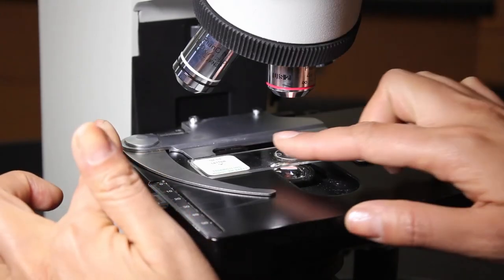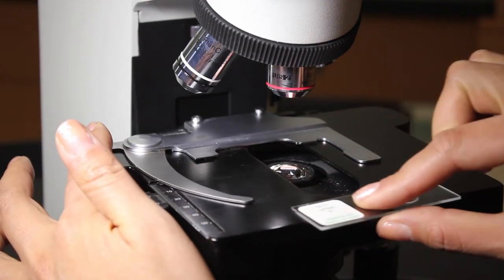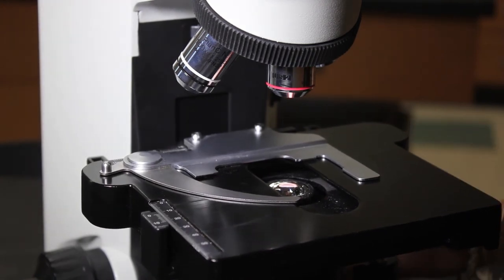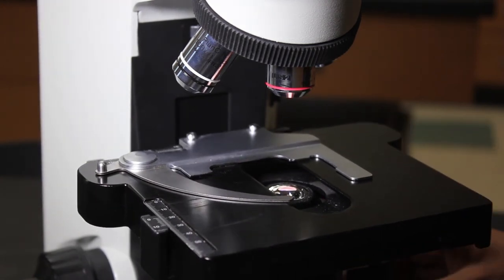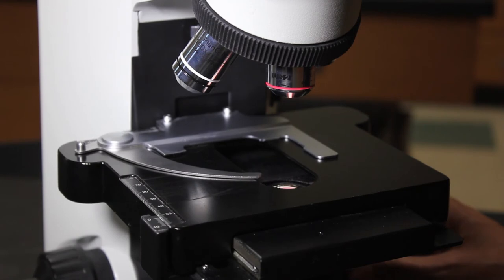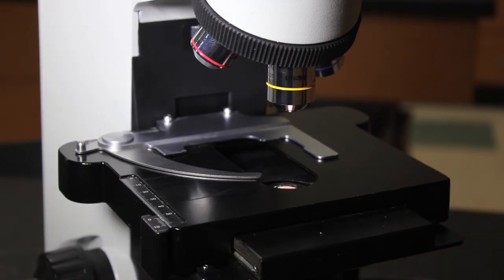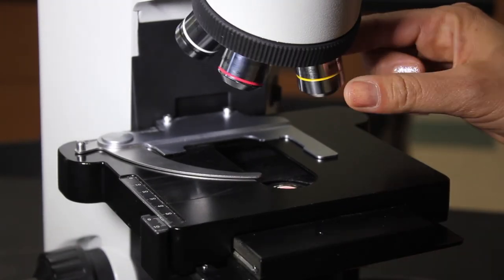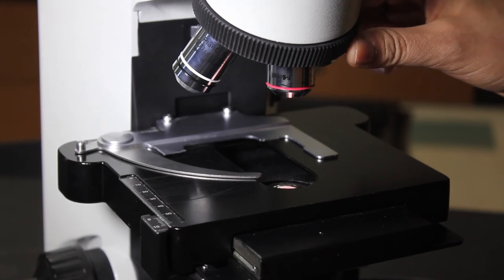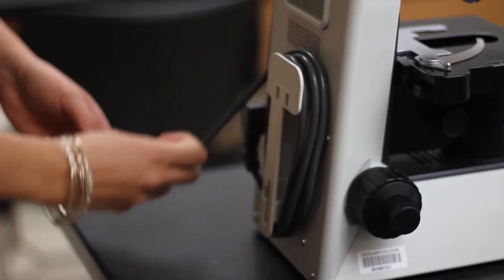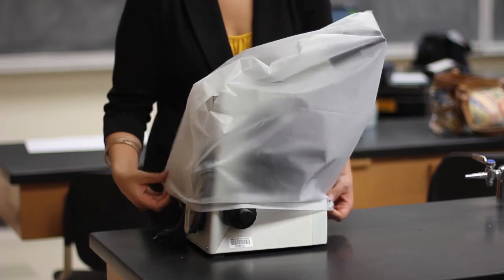When you are finished using the microscope for the day, remove slides and return them to the appropriate slide box. Lower and move the stage back towards the arm of the microscope. Rotate the revolving nose piece so the scanning objective lens is in place. Wind the cord neatly and replace the dust cover.